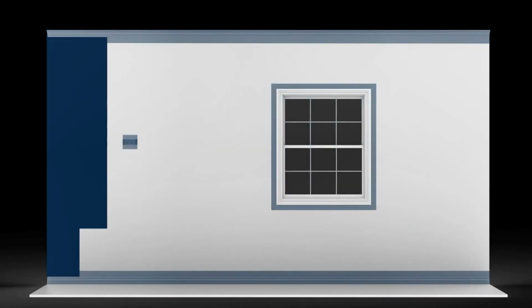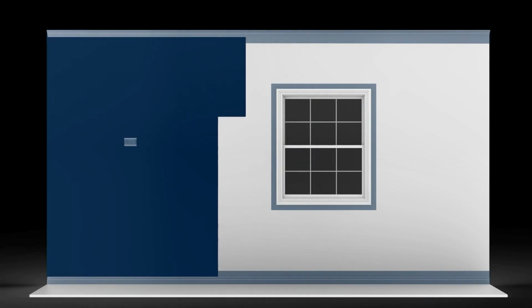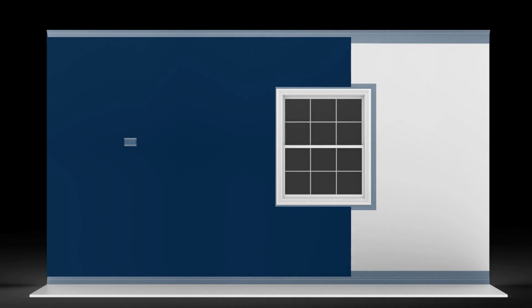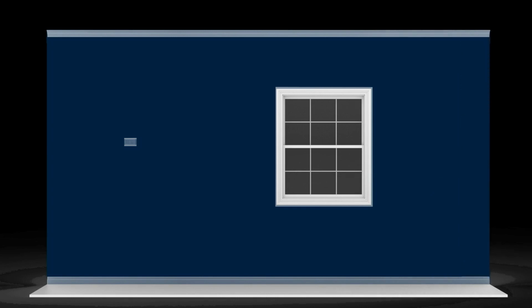Here we go. Unidirectional, overlapping strokes from the cleanest to the dirtiest. You know, we're painting a white wall blue here. If I miss a spot, you're going to see it. If you miss a spot when you're painting with disinfectant, that's a harbor point. That's an opportunity for something to grow that can cause harm to your patient. So let's take our analogy back into a clean room.